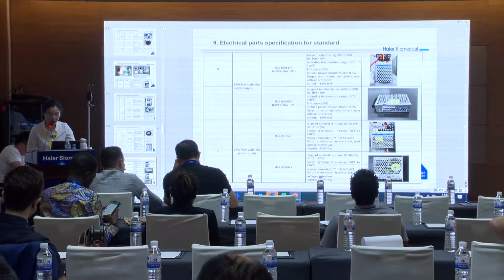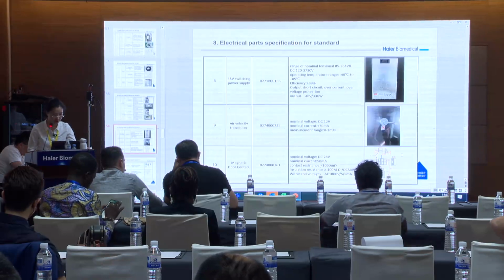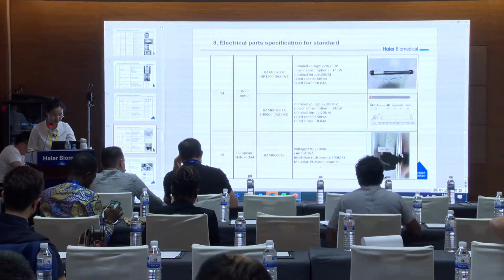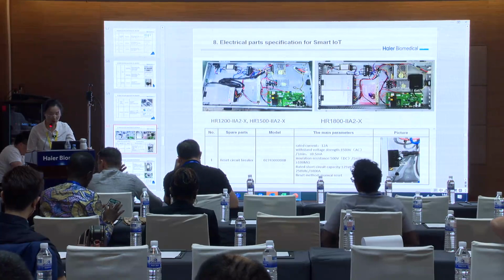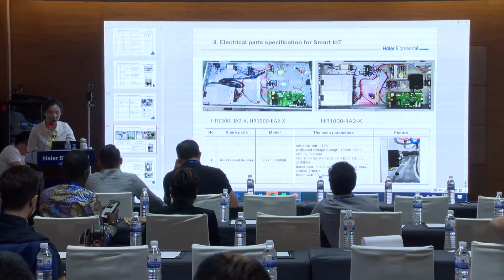And this part is all the switching power supplies we used. And this part is the electrical parts specification for smart IoT.